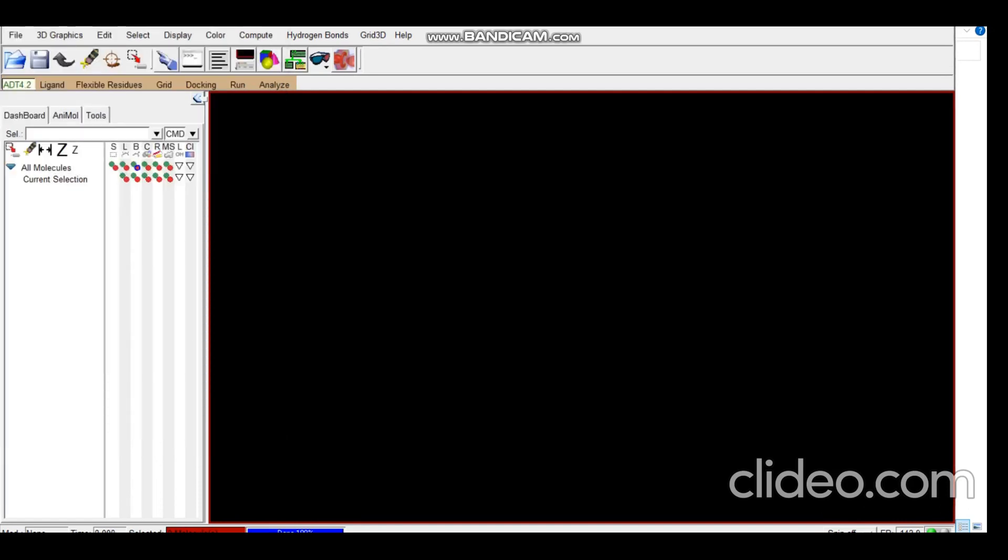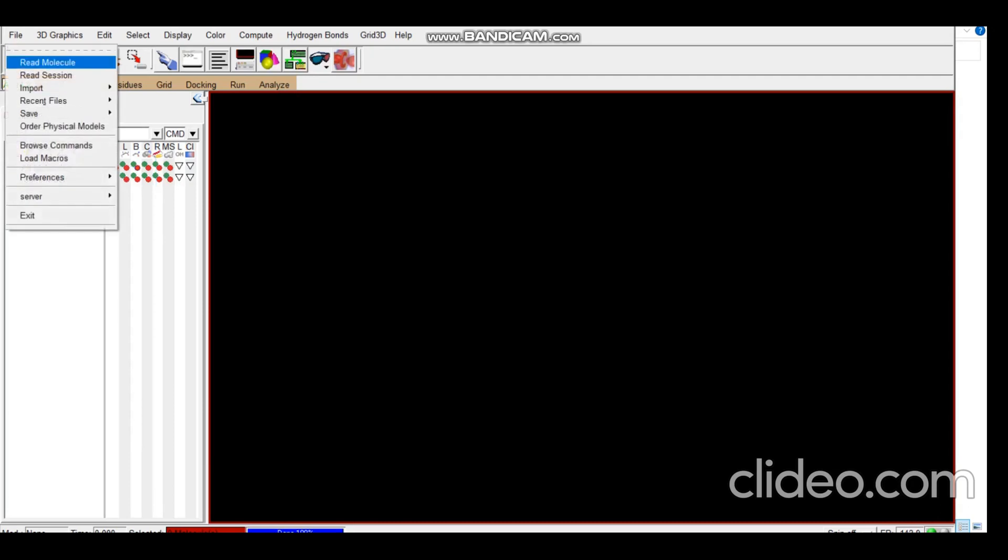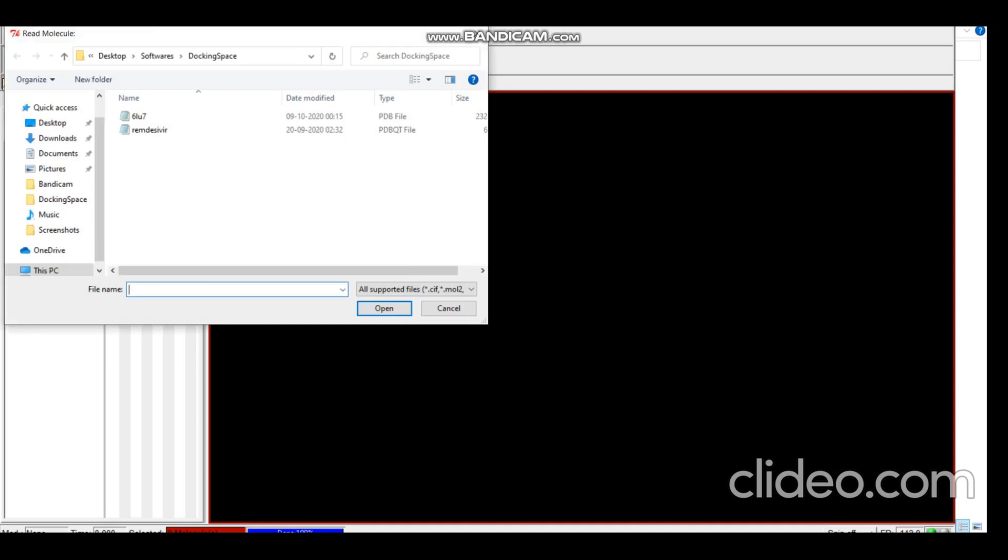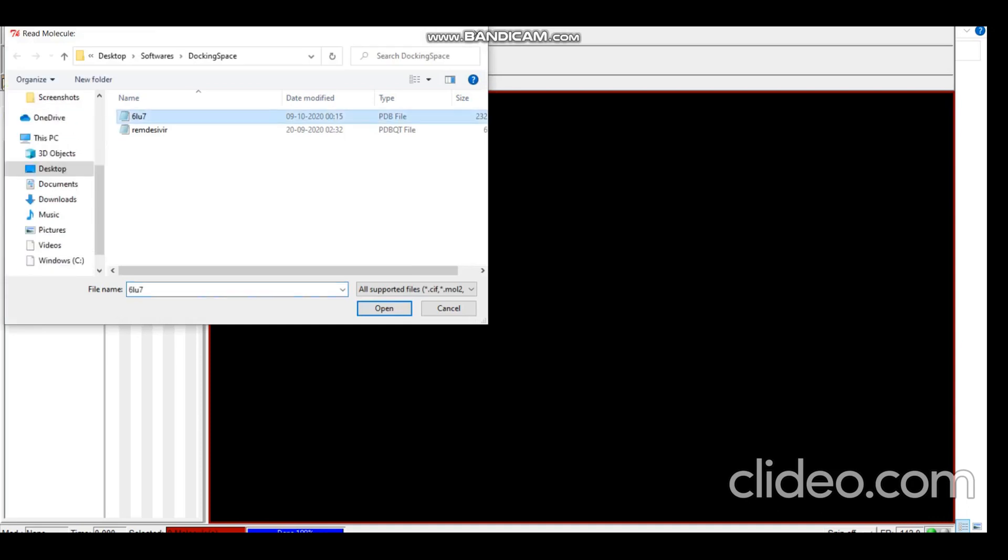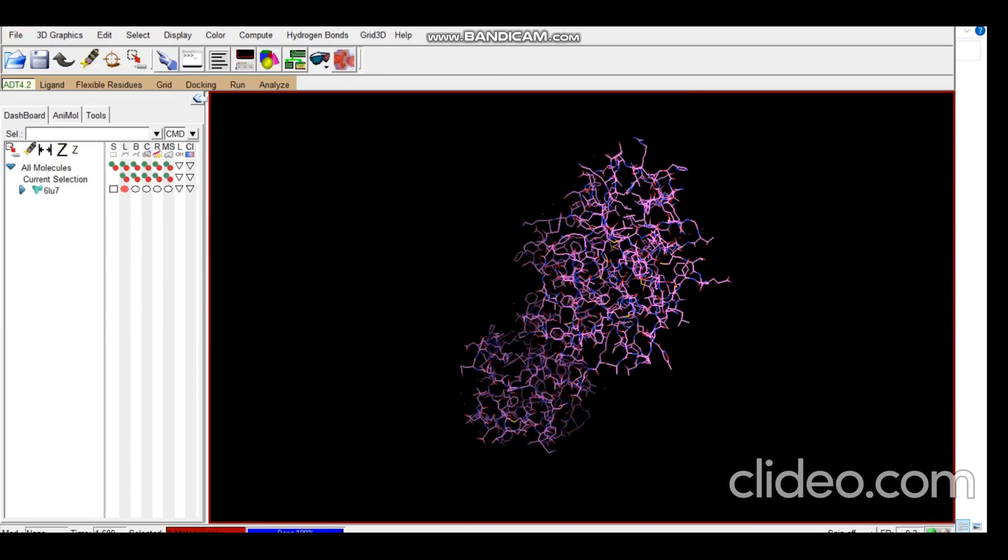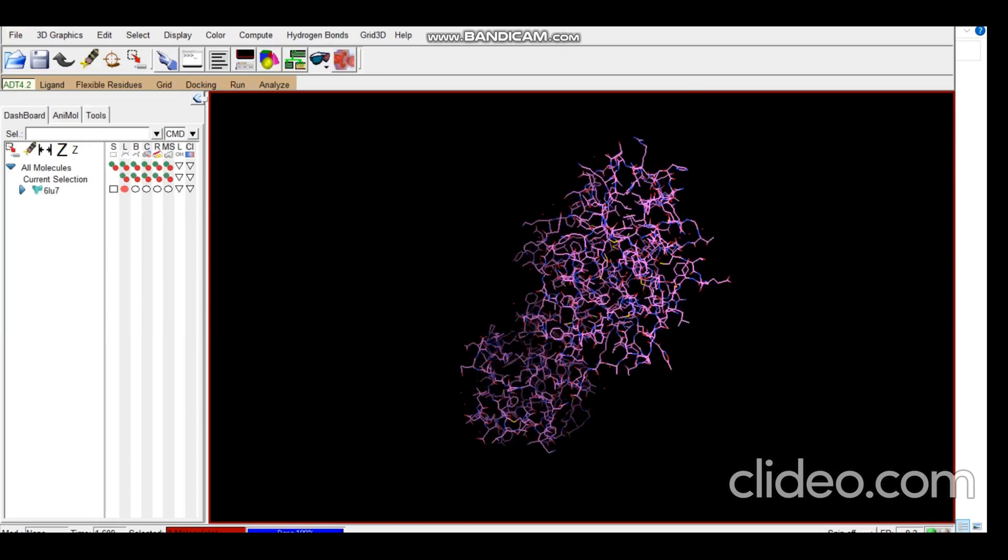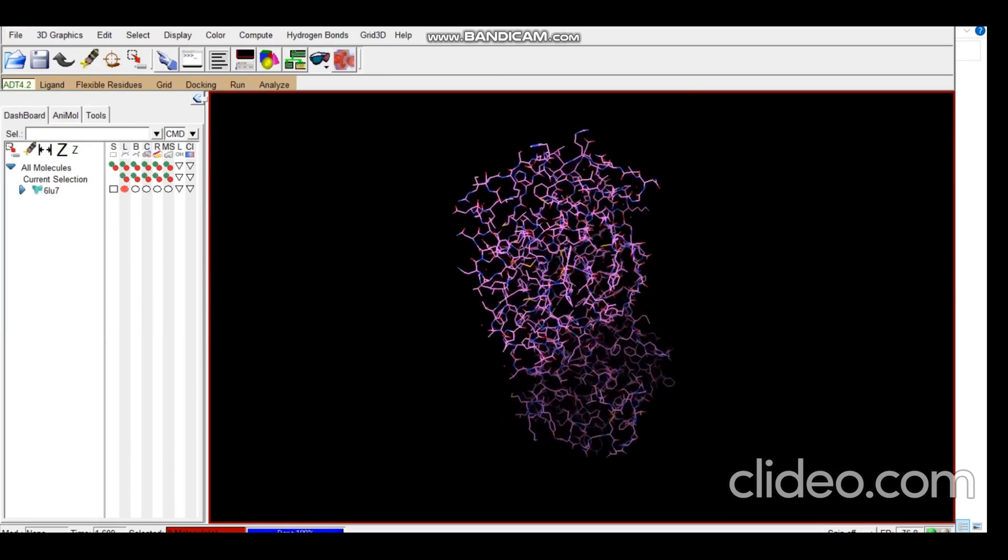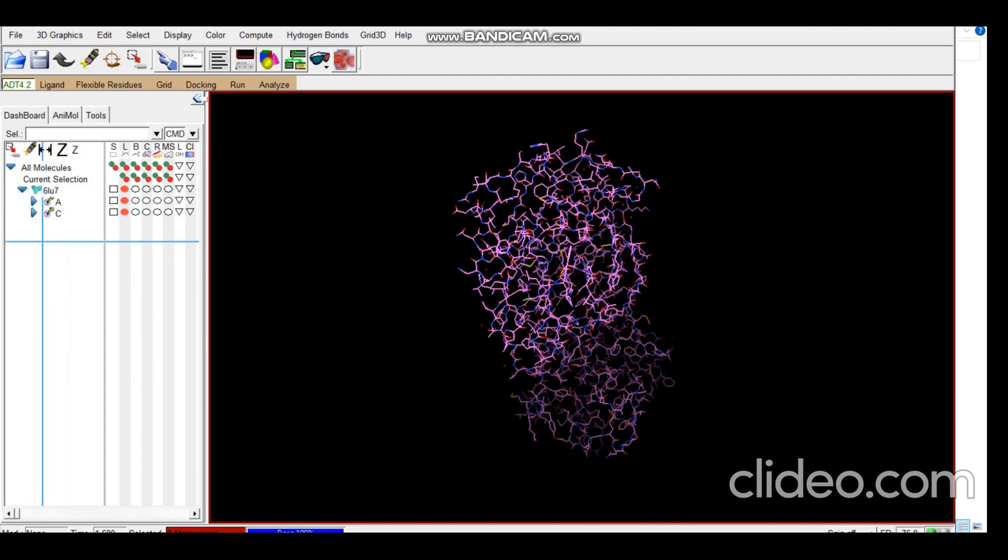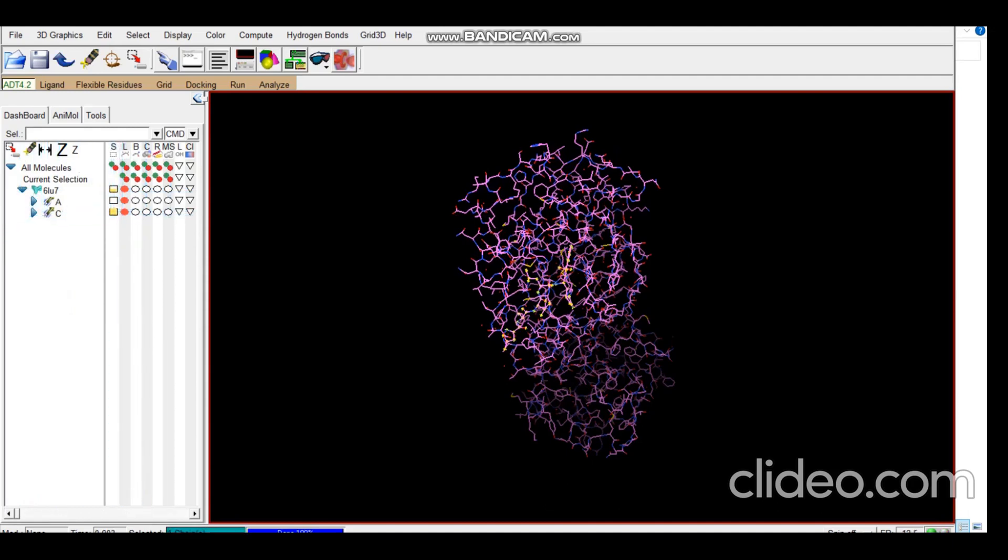So now let's start. First we go to File, Read Molecule. We'll take the PDB structure for our receptor. The first thing we need to do is get rid of all the chains that are not required. In this scenario, the C chain is not required. This information is available on the PDB webpage. You can have a look and find out all the unwanted chains or the ligands present in the receptor and get rid of them.